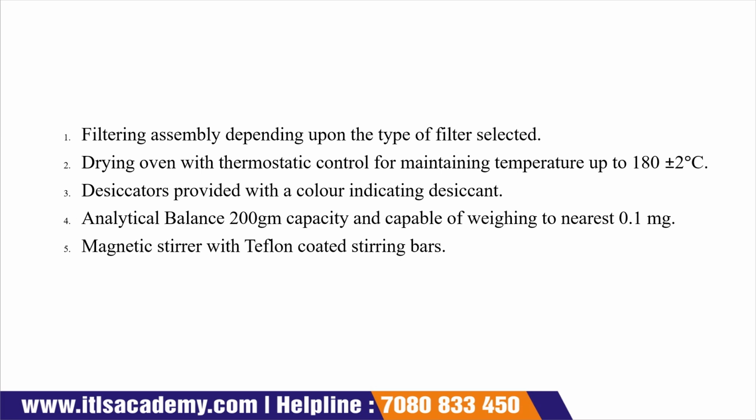The next instrument that we require is a filtering assembly, depending upon the type of filter selected. According to the filters we already discussed, we decide the filtering assembly.